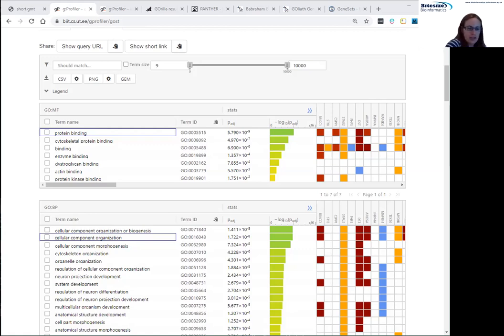As another category, we also downloaded a load of public mouse RNA-seq datasets with 2 biological replicates and did a fairly standard RNA-seq analysis to identify genes that changed the most between the 2 replicates, so where we wouldn't really expect to see differences, and then ran these genes through an enrichment analysis to see whether any particular functional categories were identified. And this did actually produce quite a lot of categories to add to our list of potential suspects. So these we then used in GOLiath.